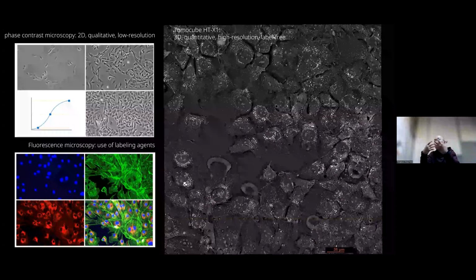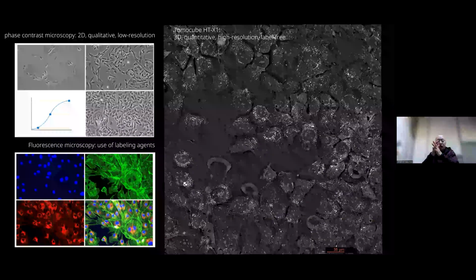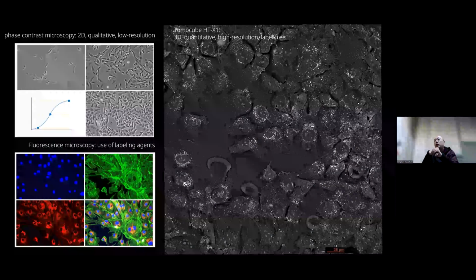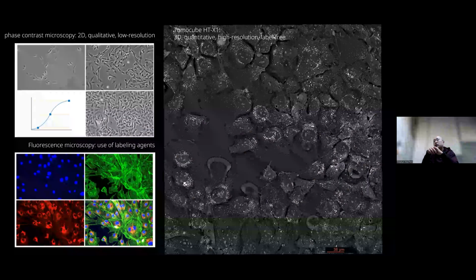So we can measure subcellular structures such as nucleus, membrane, nucleoli, mitochondria, lipid droplets, and so on. But the small subcellular organelles and other subcellular organelles cannot be readily distinguished from our raw data. So that's why more advanced imaging features, such as combining AI, might be helpful. This is the ongoing project we are trying to achieve.